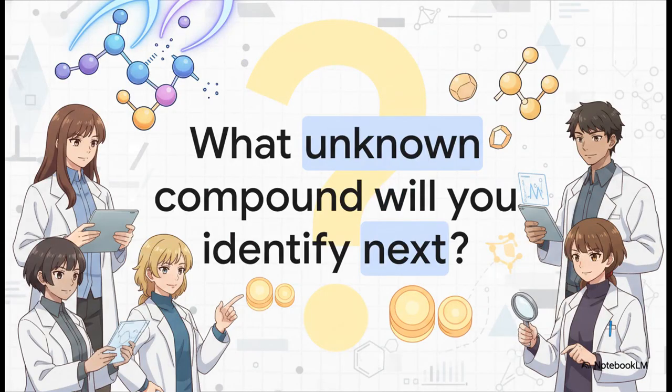And that brings us to the end of our journey today. By understanding the fundamentals of ionization, recognizing unique fragmentation fingerprints, decoding those clever isotopic ratios, and applying a systematic 4-step strategy, you are now fully equipped to solve molecular mysteries. Whether it's for pharmaceutical analysis, environmental monitoring, or investigating a forensic crime scene, these are the exact tools experts use every single day. So, I leave you with this thought.